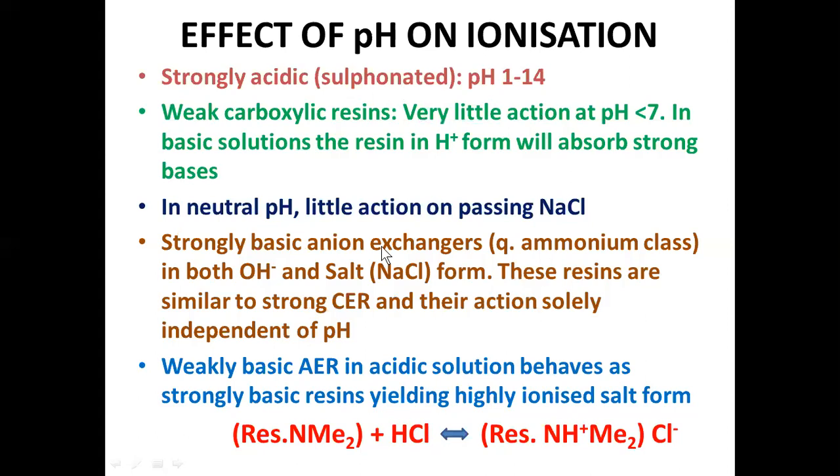So, weakly basic anion exchange resins need to be maintained with acidic solutions. When you maintain an acidic solution, these resins behave like strongly basic resins. Say, for example, you take a dimethylamine resin. Nitrogen is attached to the polymeric surface, and the nitrogen is substituted by dimethyl groups.